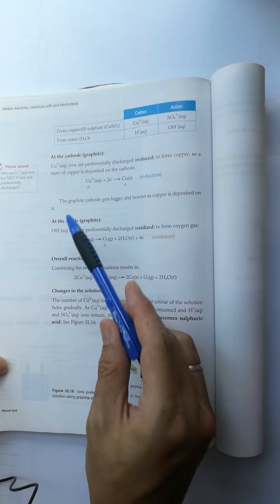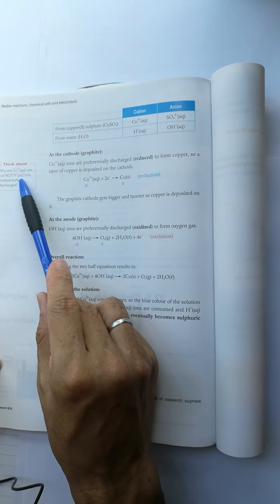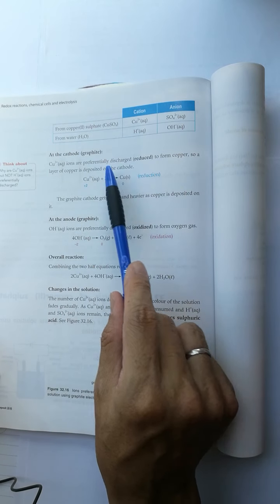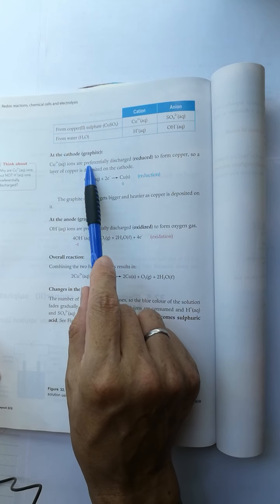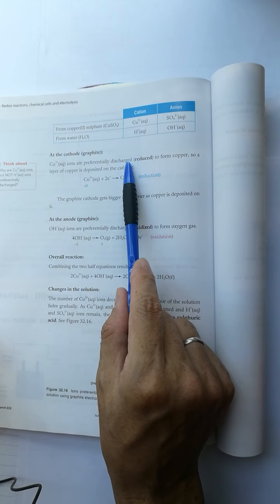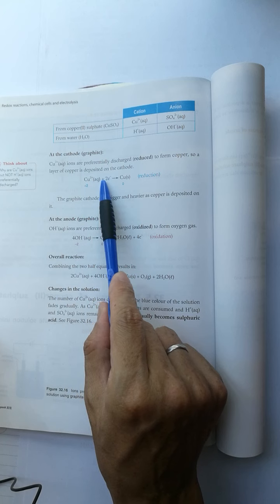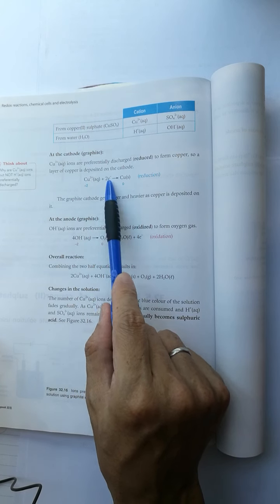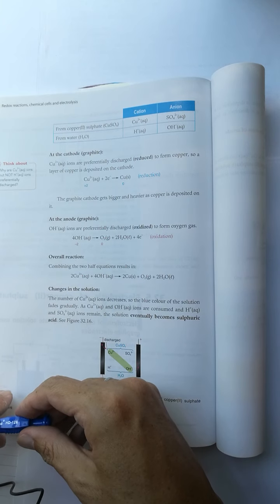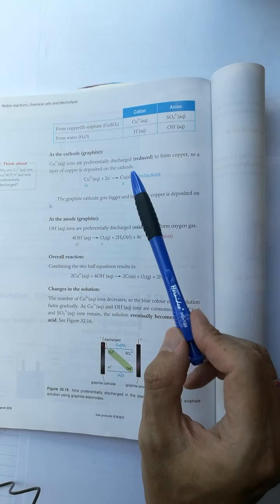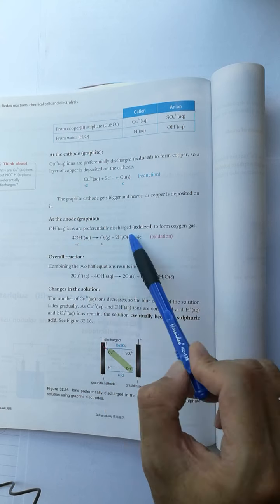For the copper(II) ion, it is a stronger oxidizing agent than the hydrogen ion. As a result, copper(II) ions are preferentially discharged, gaining electrons to form copper metal. The observation is colorless oxygen gas formed at the anode.